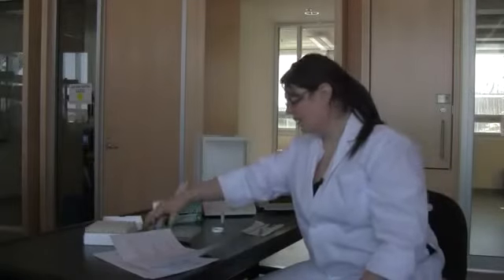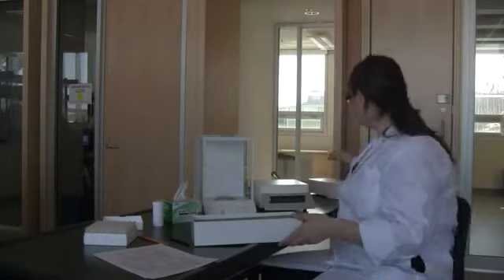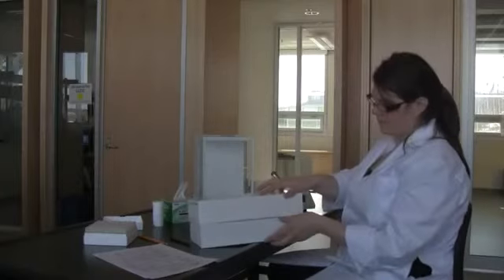So now that I've done all my samples and filled the submission tray, it's time to submit them to the lab. Once it's filled, I cover the lid securely and place it inside the box for shipment, along with the submission form where you've recorded the target weights of each capsule. And now it's ready to go.